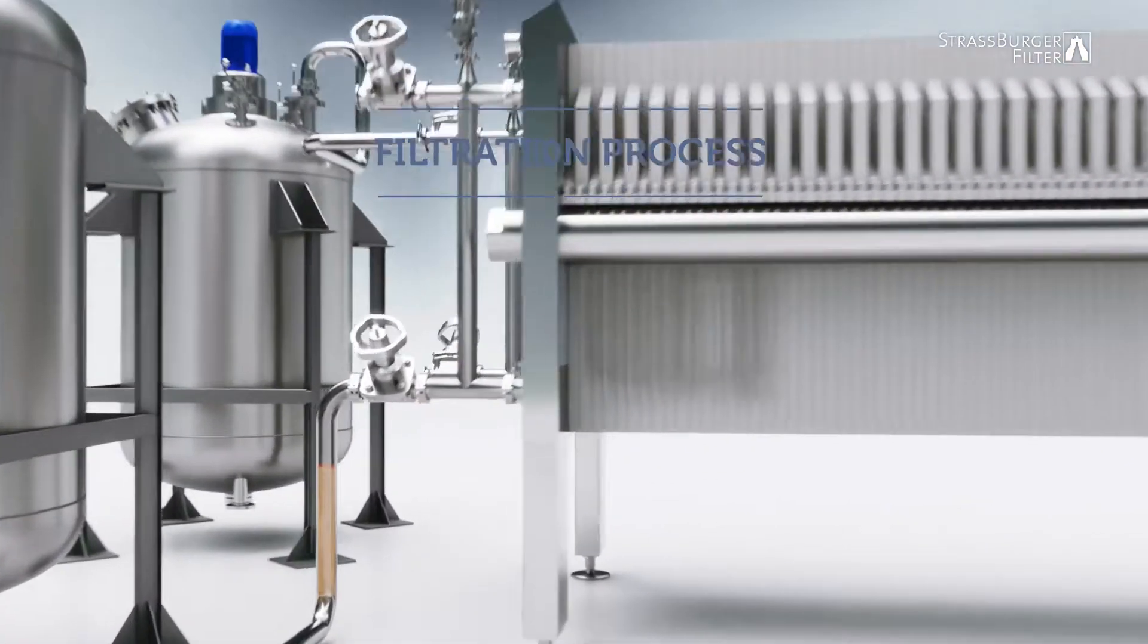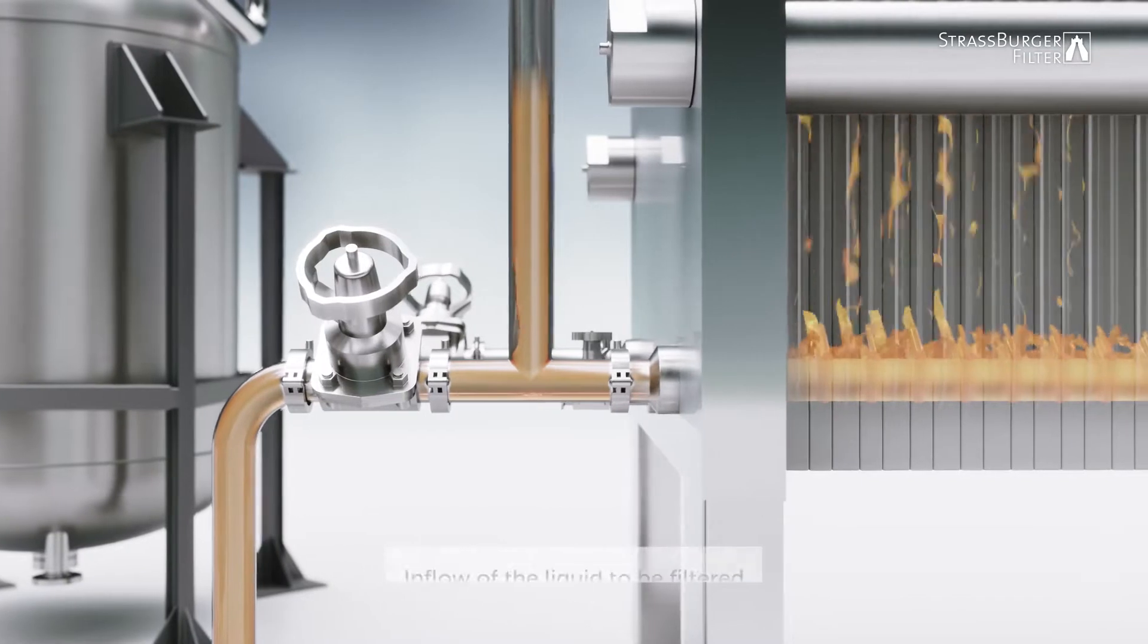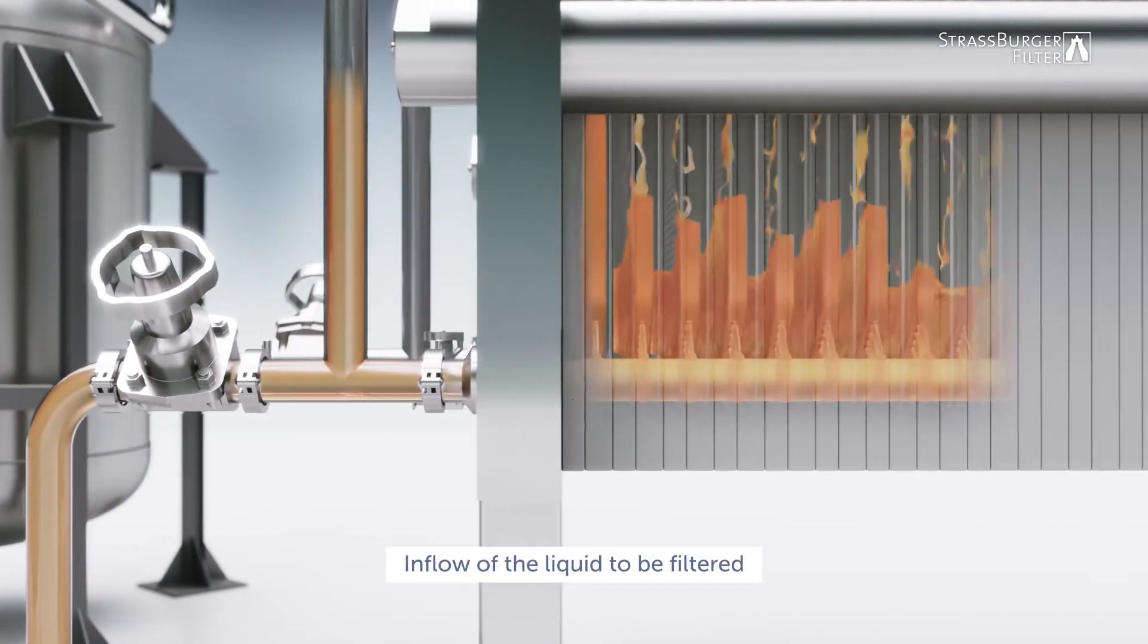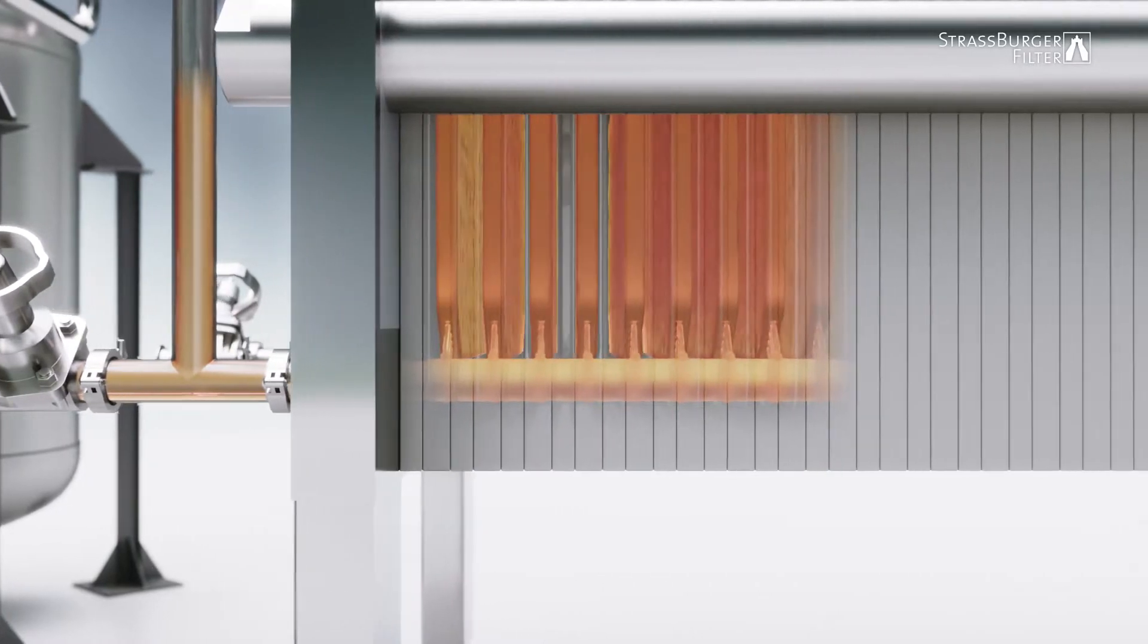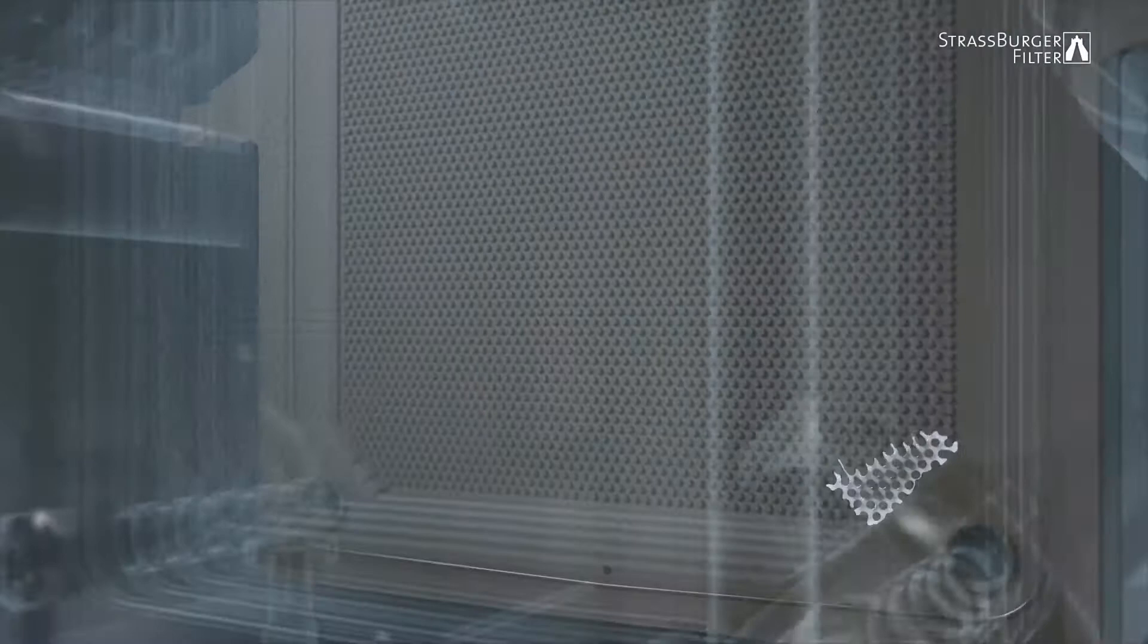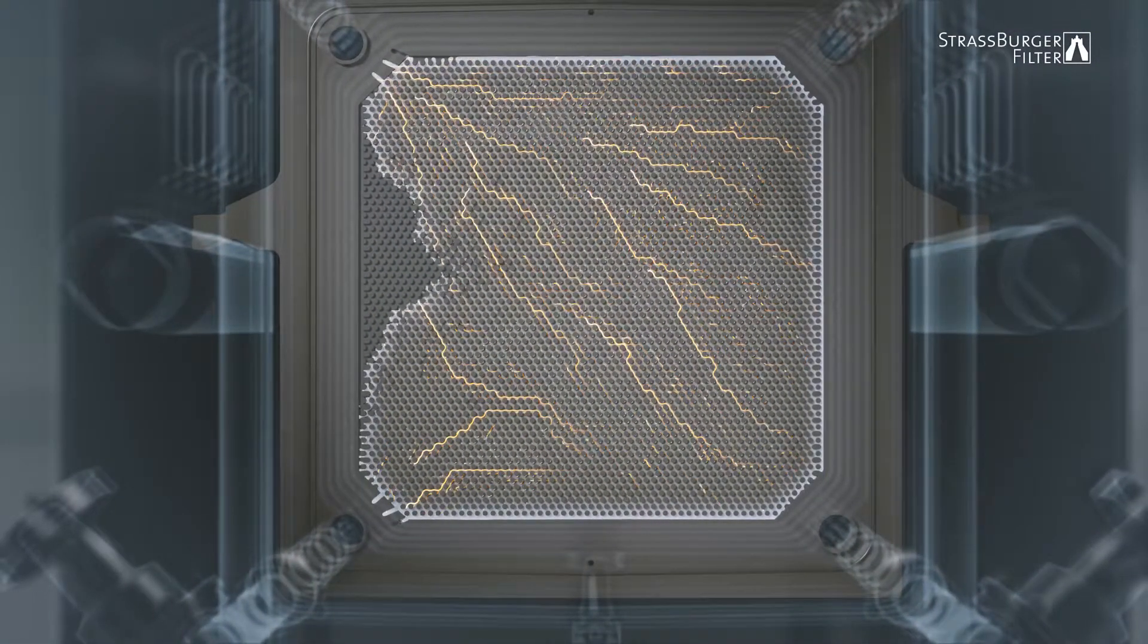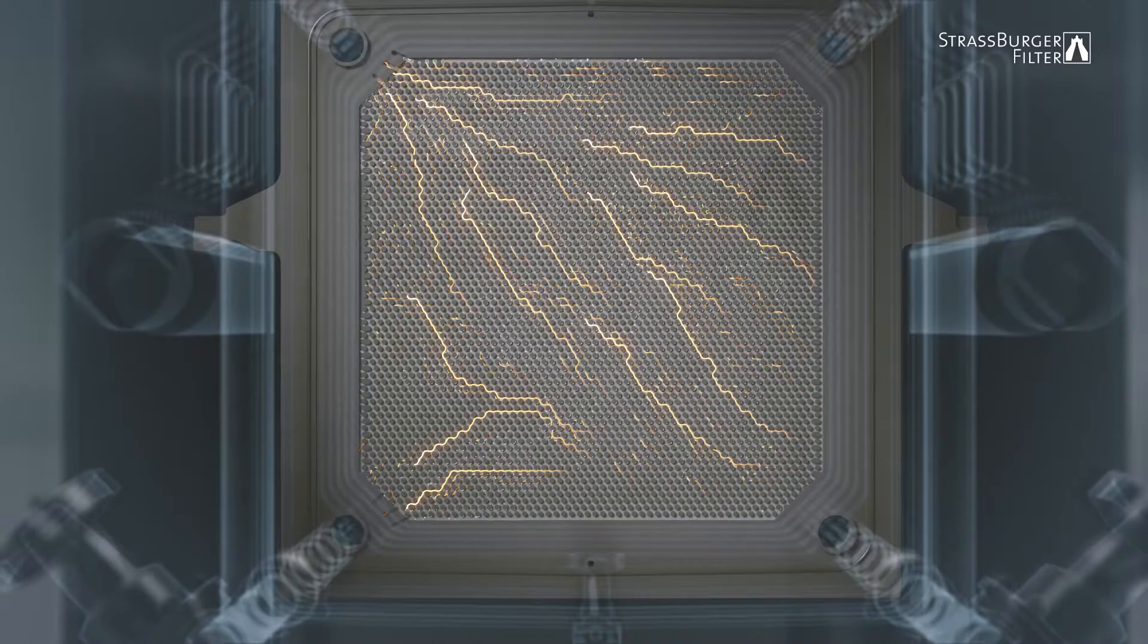The filtration process takes place in various steps. First, the liquid to be filtered is introduced through the inlet. The unfiltrate flows into the frames and fills them completely. The filtrate then collects behind the filter layer, between the nubbed field of the filter plates, which ensures even liquid distribution.